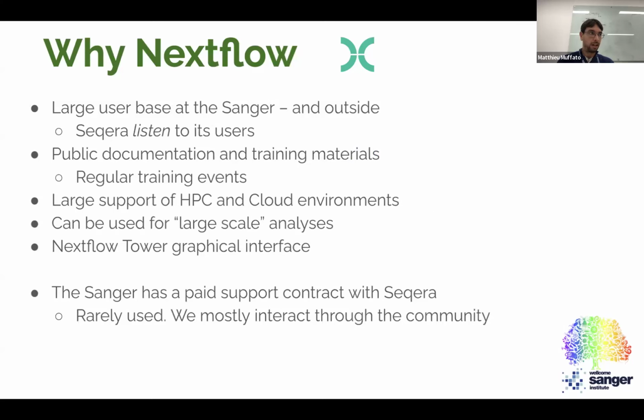Nextflow is a workflow management system and a workflow language. That's the language in which we describe which steps, which software to run, in which order. It's a very popular one. It had a large user base at the Sanger, but outside as well. One really key element is that the company behind Nextflow, Seqera, does listen to its users. They've got a big community on Slack. They have regular events where we can meet them. They come to the UK, they come to their countries, and we go there to attend the big summit they have every 6 months. So there's that communication going on.